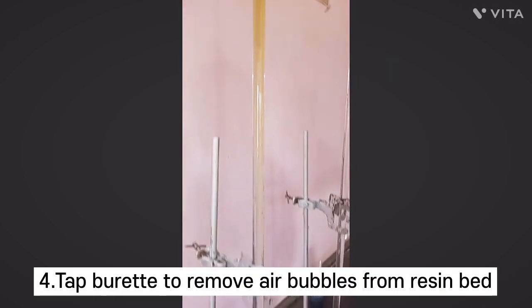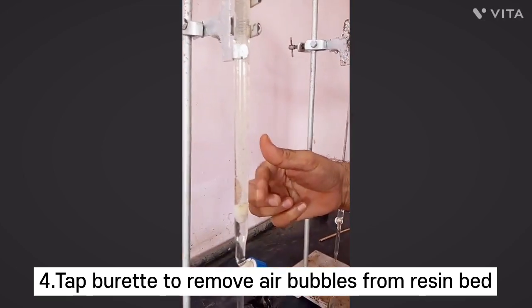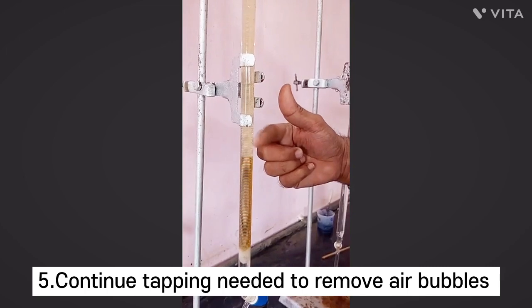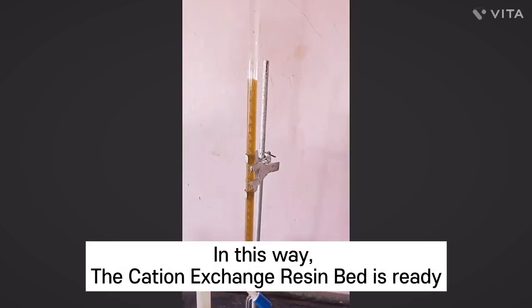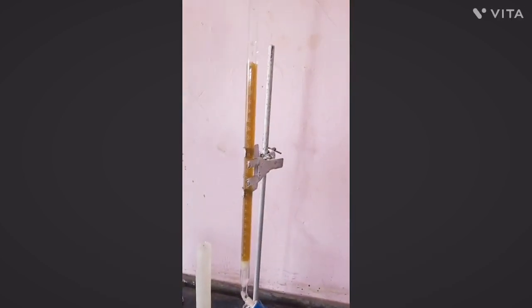Meanwhile, the burette is tapped to remove the air bubbles from the resin bed. The tapping is continued to remove air bubbles in the resin bed. In this way, we get a cation exchange resin bed of Amberlite IR 120 of 25 centimeter height.